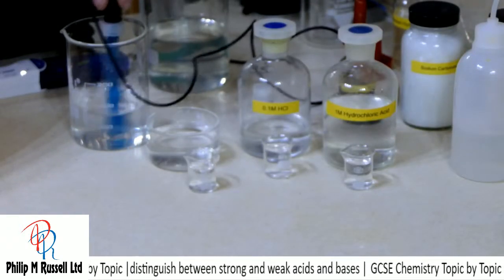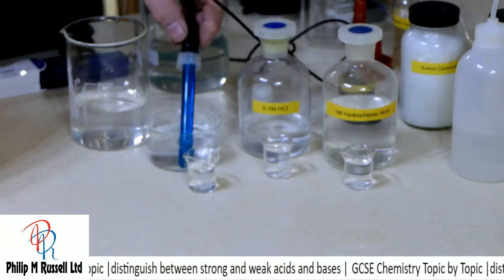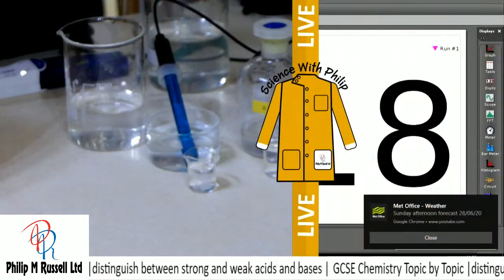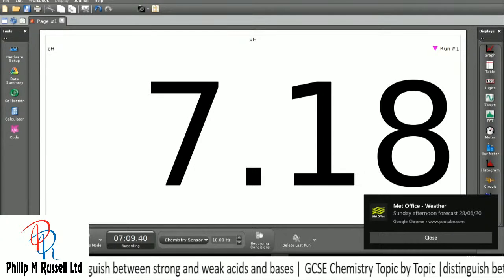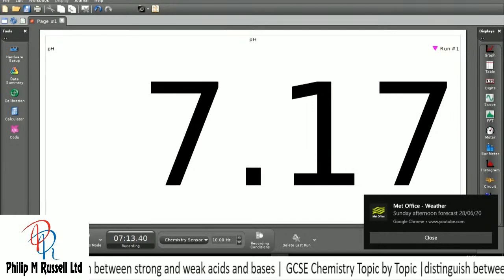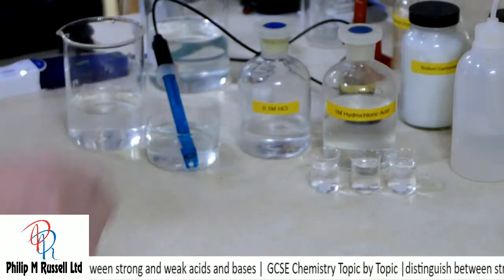And we'll give this a good rinse, and we should see this returning to about pH 7.1. So I've got 3 little beakers there. We've used some acid and we've used some alkali.